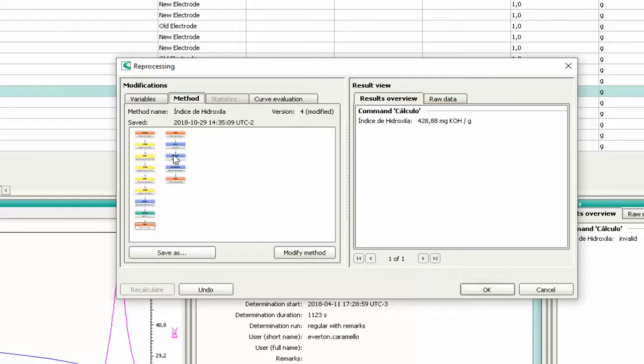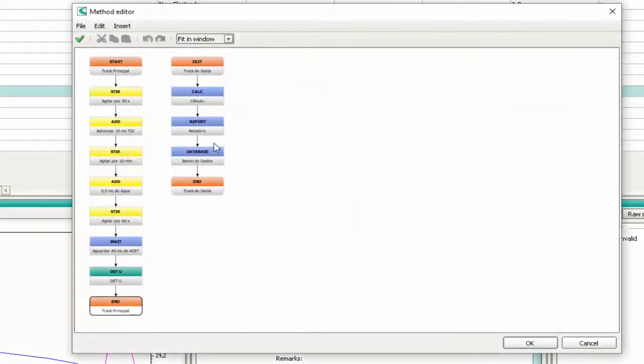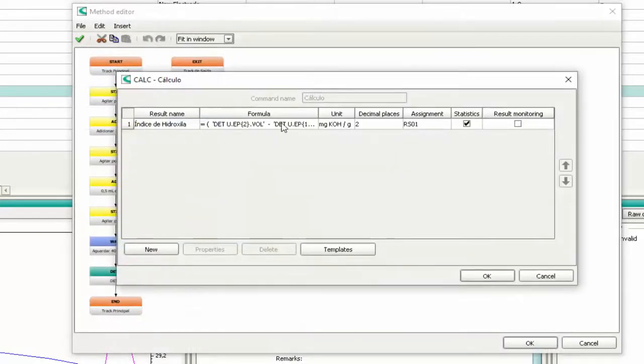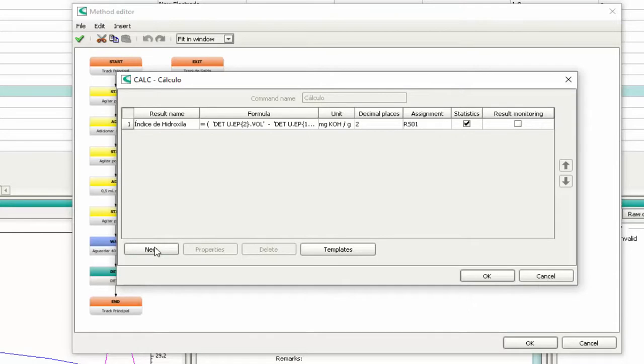If there's an error in the calculation, you will need to change the calculation in the method by pressing 'Modify method'. Double-click on the blue command 'Calc'. You can change the calculus by double-clicking the calculation line, or you can add a new calculation by pressing New.